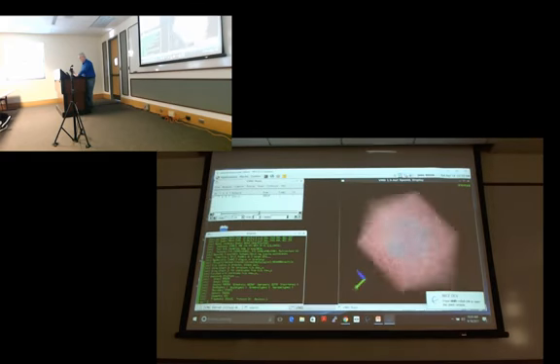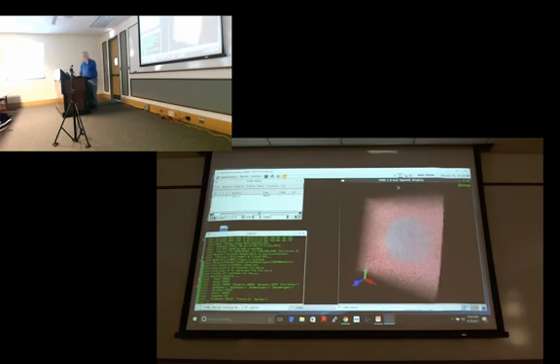So this is a VMD session running on a computer in our server room somewhere else. I just gave a demo of this running from Stockholm, Sweden. So not only can I do it in the same building, but I can also do it halfway around the world. So it doesn't just work if you're physically co-located. The only requirement is that you have a decent network connection. And I did it live in my presentation in Stockholm, Sweden, literally 6 days ago, using Wi-Fi in an average lecture room. They have better Wi-Fi than we do, apparently.